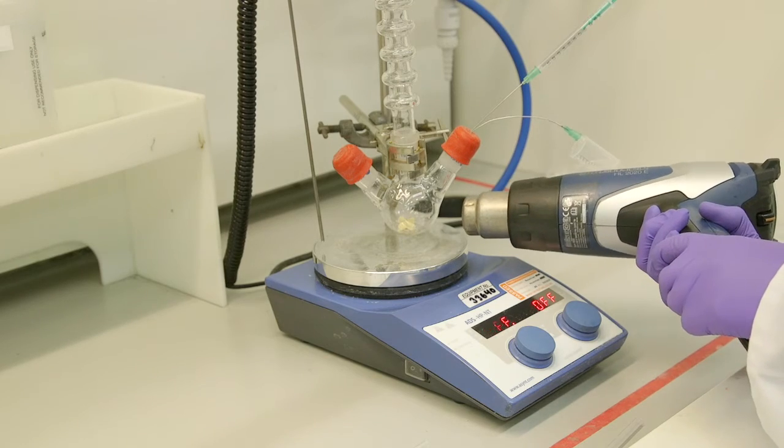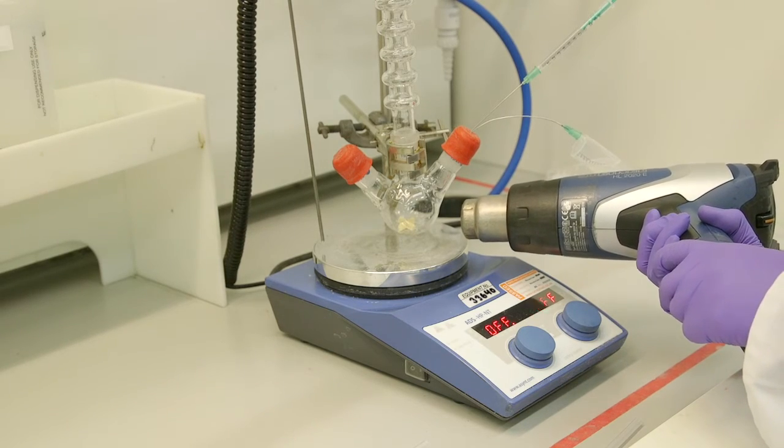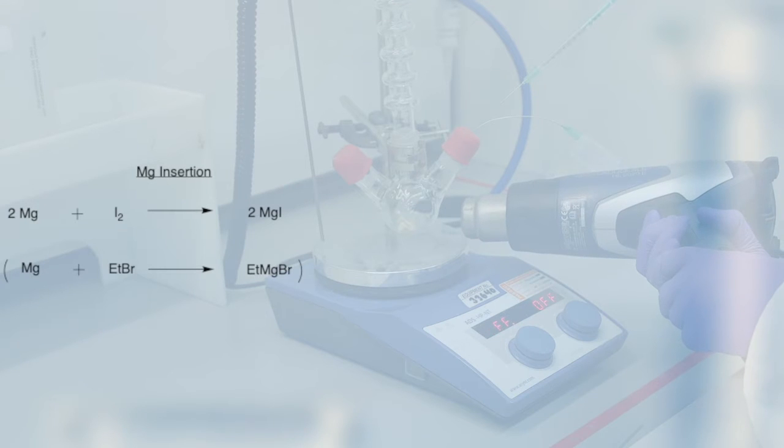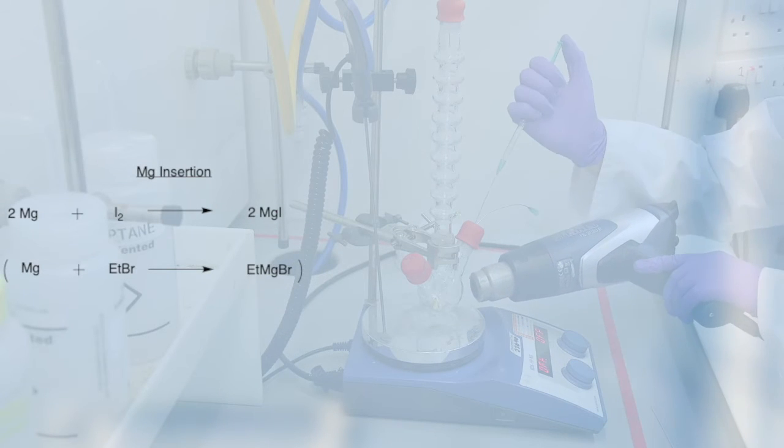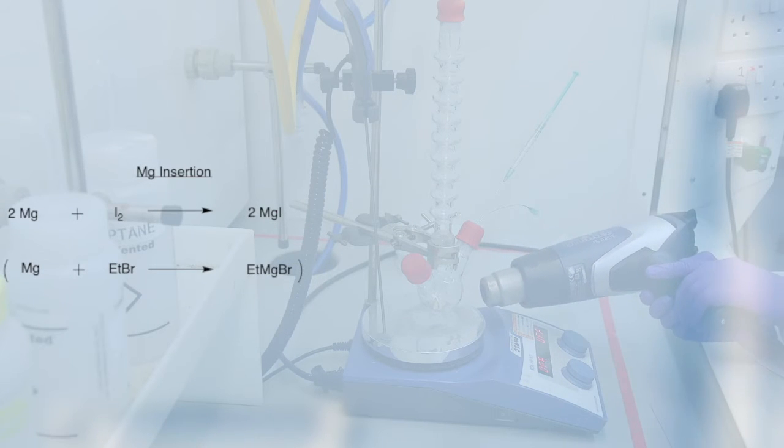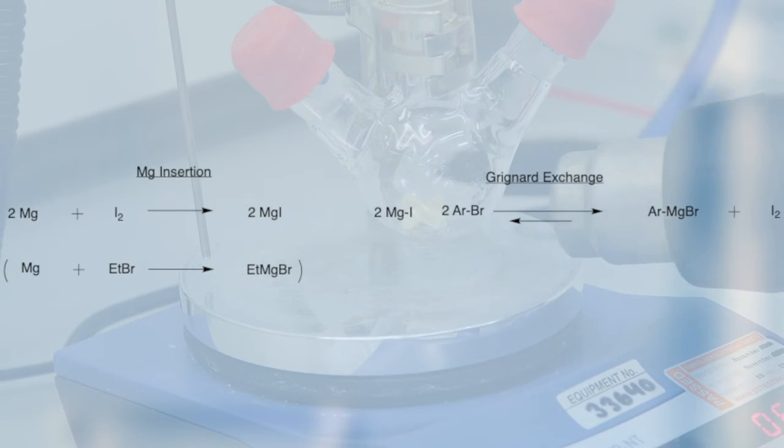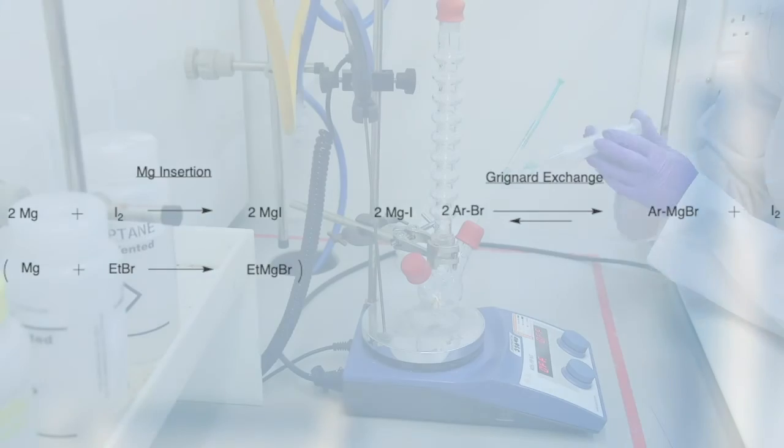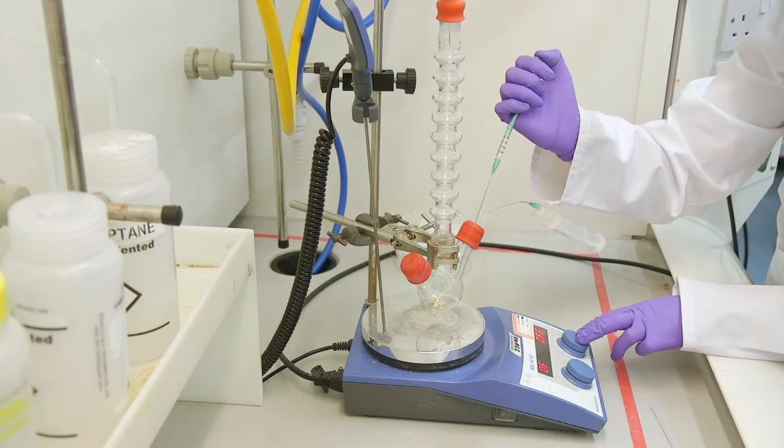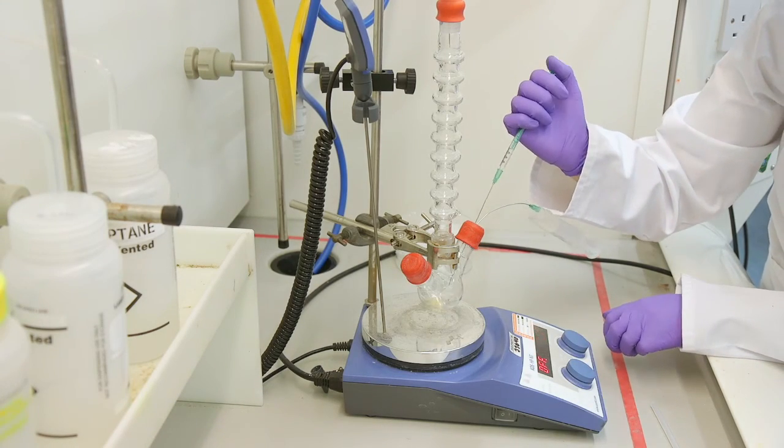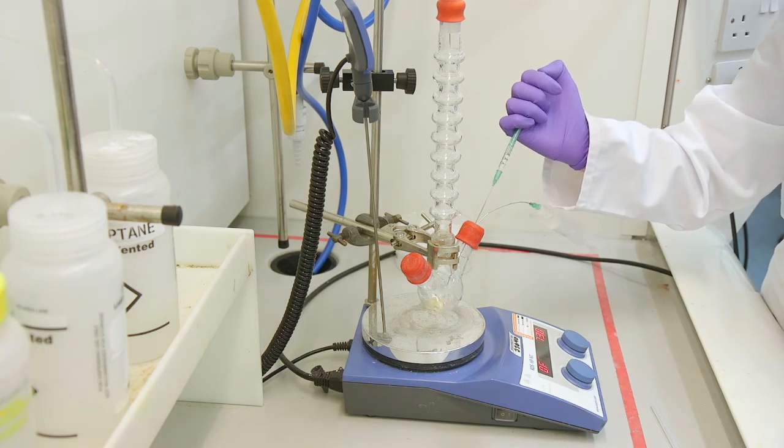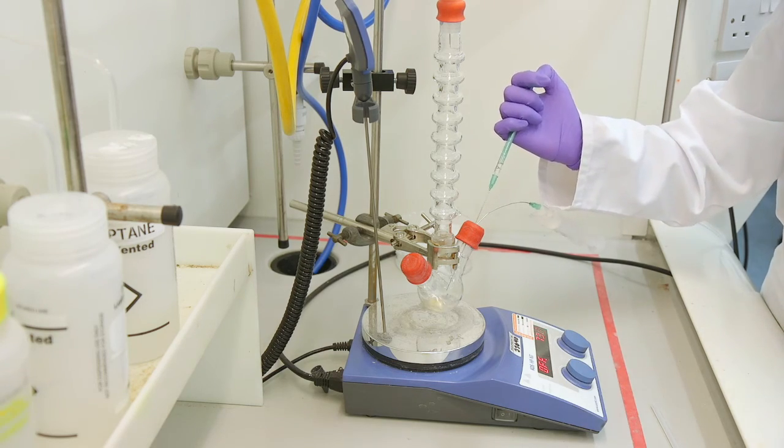If no heat is evident the reaction may need an activator. An activator can be iodine either in drop or pellet form or ethyl bromide. Iodine is more reactive than the bromide on our substrate so this will insert first. Then you will get a transmetallation taking place for the Grignard formation. If you want to add an activator to the reaction make sure this has been added before the addition of most of your substrate otherwise you will lose most of your substrate.